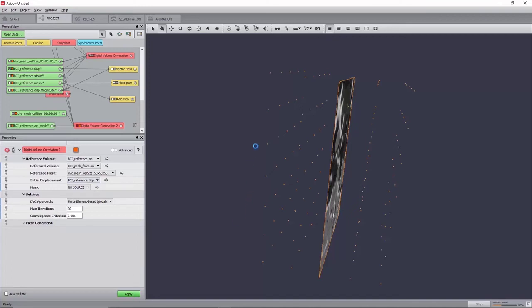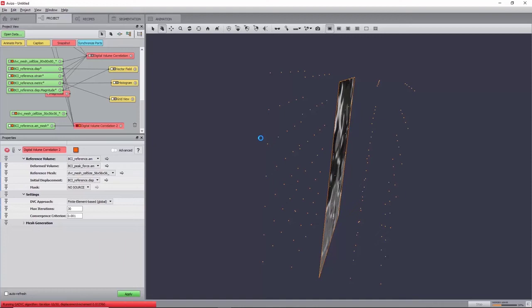Similarly to the local approach, this will create a displacement field and a strain tensor, but unlike it, it will also create a residual image instead of a metric map. In this global approach, the displacement field is obtained by minimizing correlation residuals.